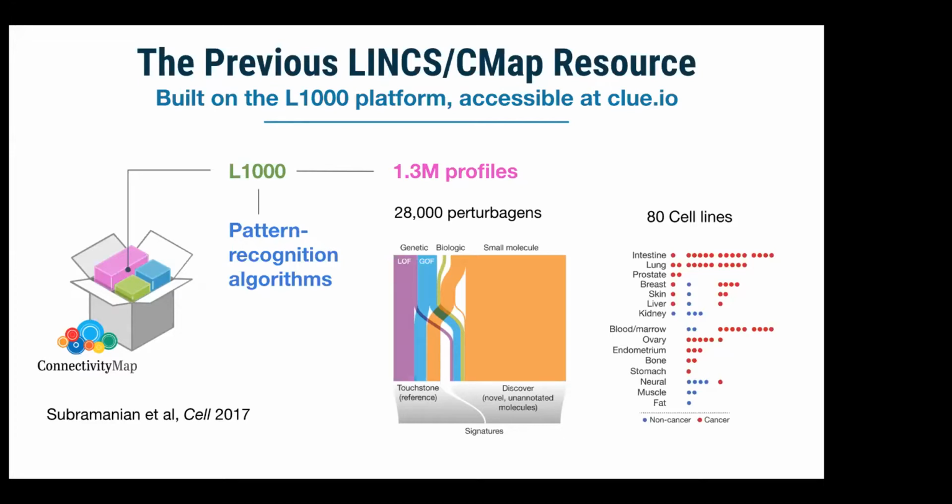And at the time of the release, the data set contained about 80 cell lines. A subset of 9 cancer cell lines were profiled most predominantly and densely, and that comprises the Touchstone portion of the data set. But there were other more ad hoc projects that were done in more niche types of cell models, and there's sort of a long tail of cell models that have fewer profiles, but in total there's around 80 different cell lines.